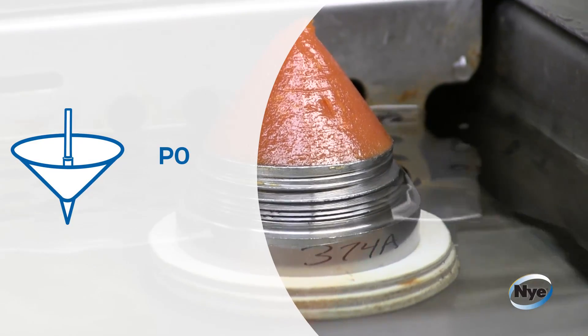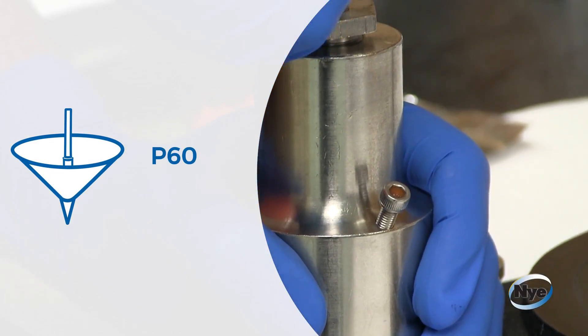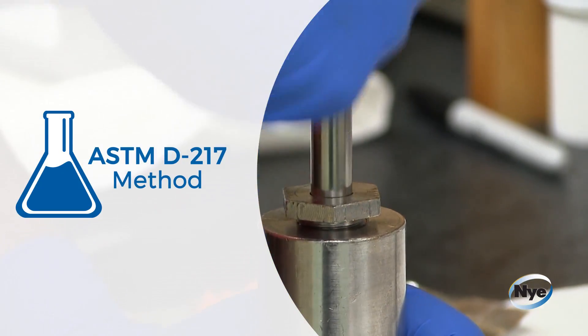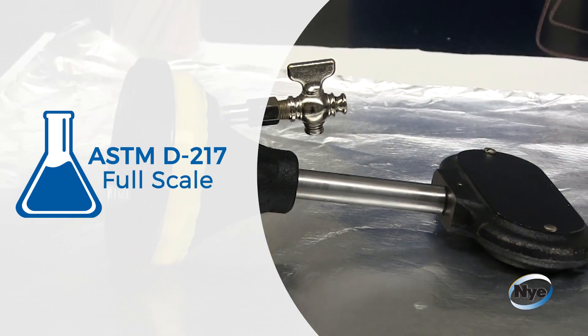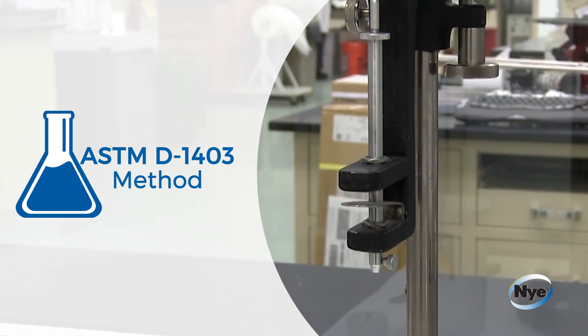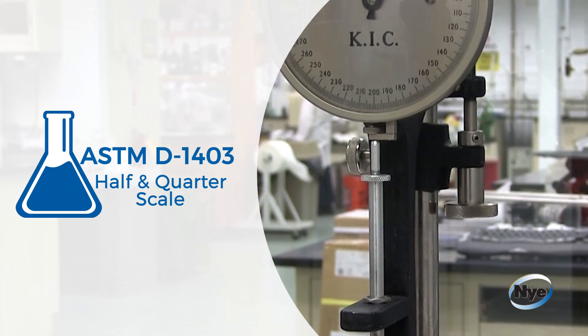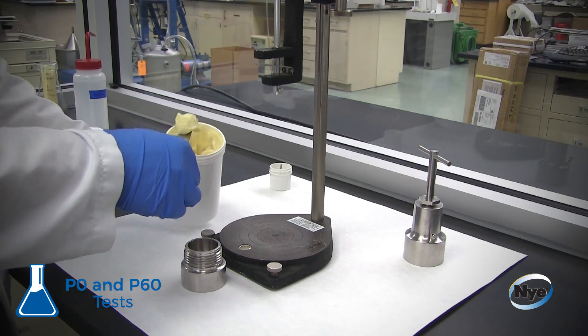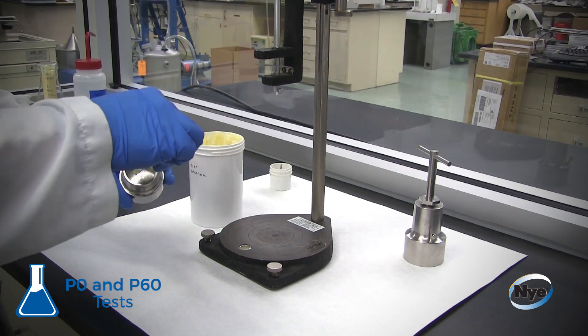The P0, or unworked, and P60, or worked, penetration tests follow ASTM D217 method for full scale, or ASTM D1403 method for half scale or quarter scale. They are two of the four required tests performed on every single batch of grease at Nye prior to shipping.